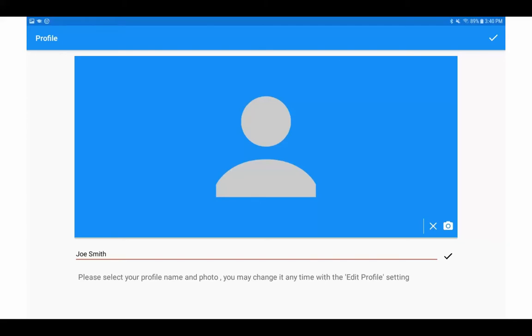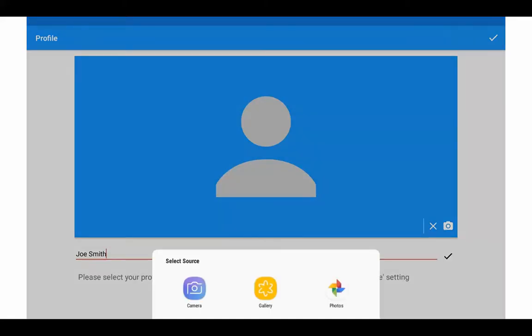Also, they can place their own picture into the student profile. They'll do that by clicking on the camera icon on the lower right hand side with the head and shoulders icon, and then they are able to select the source, either the camera for a live image or images from either the gallery or the existing photos on the device.